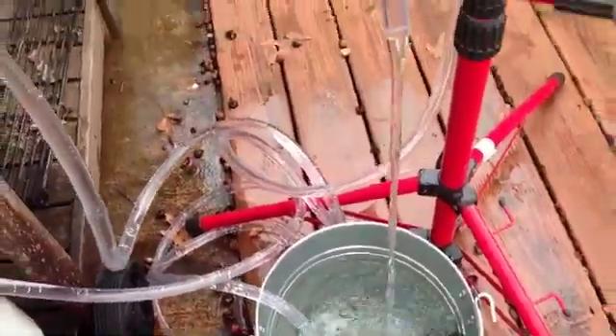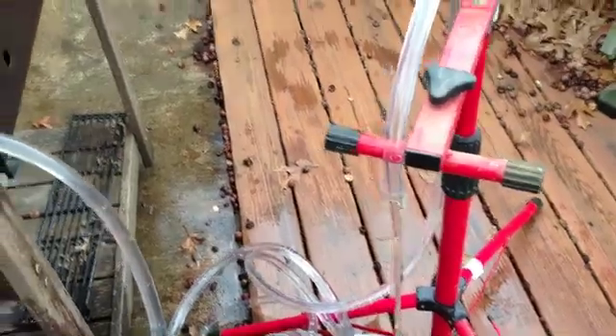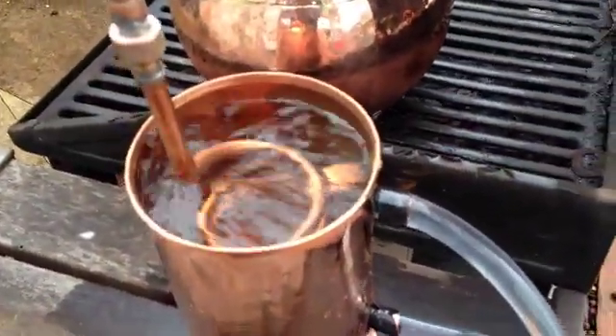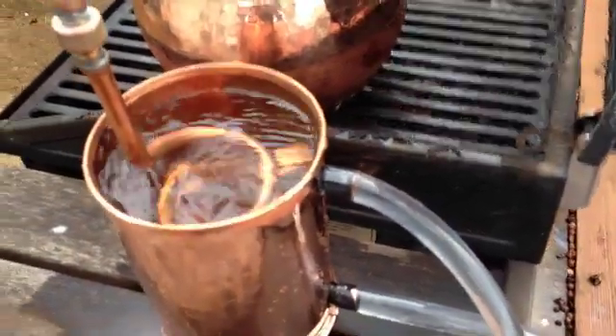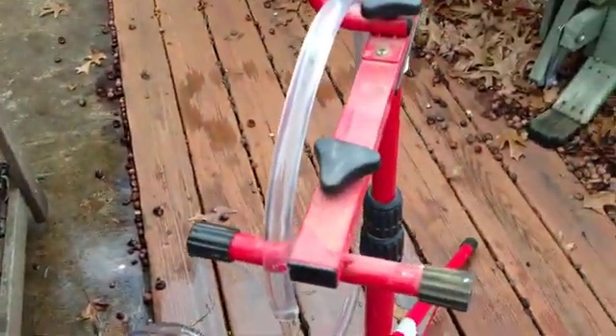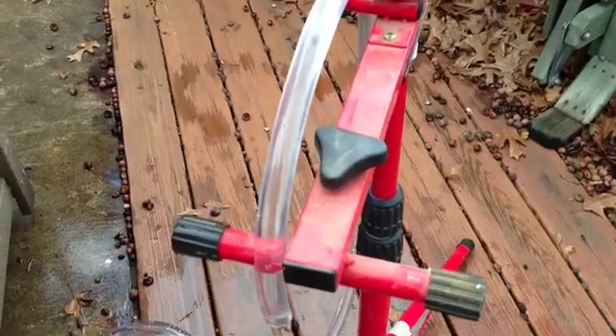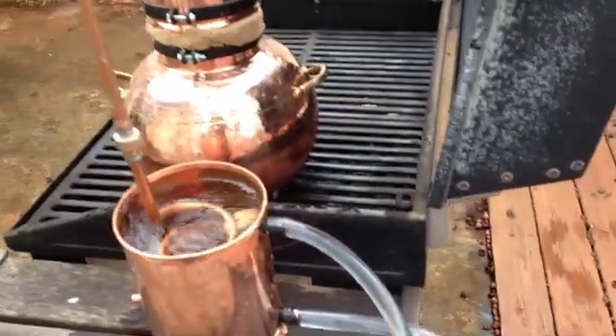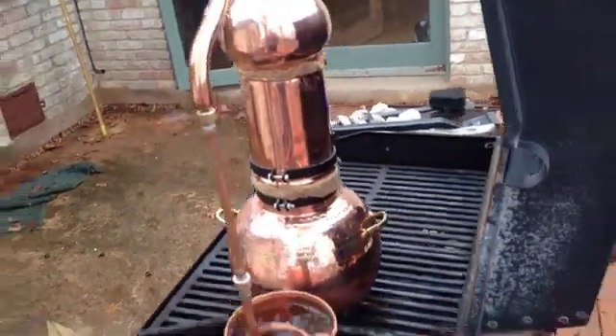I have a contraption kind of set up. I needed to adjust the pressure to keep the water level in the condenser as high as possible. To do that, I had to adjust the height of the drain pipe right here. So that's kind of what we're doing today.